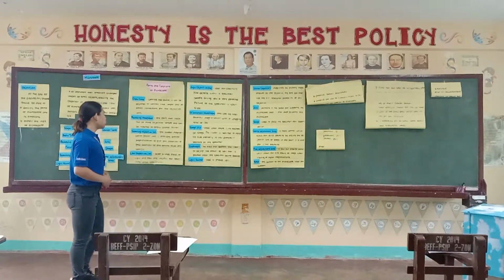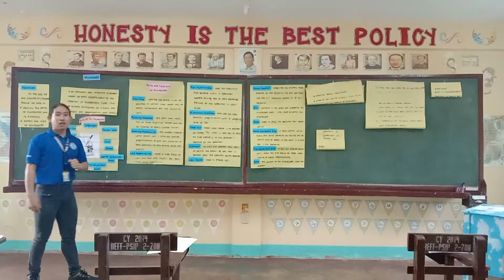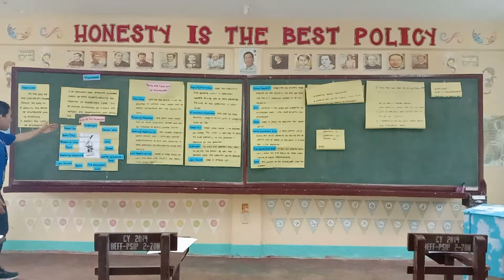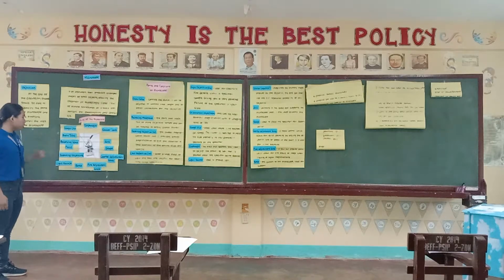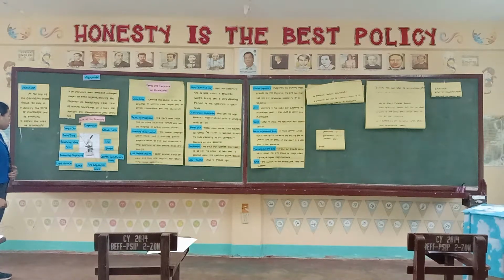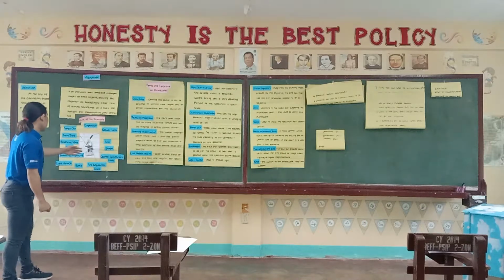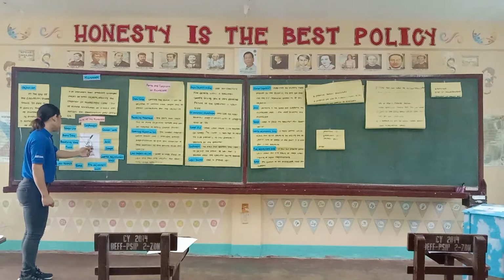Alright. Now let's move on to the stage clip. Mr. Gary Cavillar, could you please locate here in the illustration which part is the stage clip? So the stage clip is over here. This one. The stage clip.